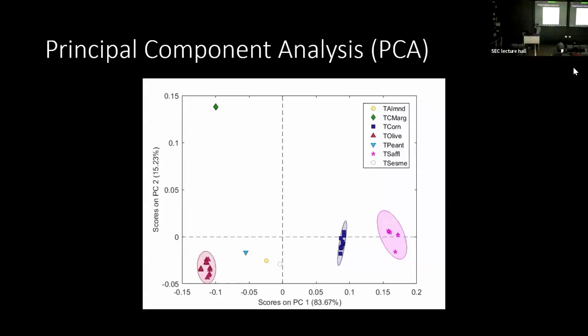From Zoom, what accounts for very different Raman spectral shifts for different excitation wavelengths for some materials and not others? So that is usually if you're coupling into an electronic transition and you're getting a resonance enhancement, you're getting specific modes that are in a resonance Raman state rather than an off resonance state.